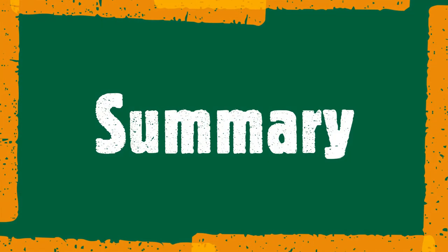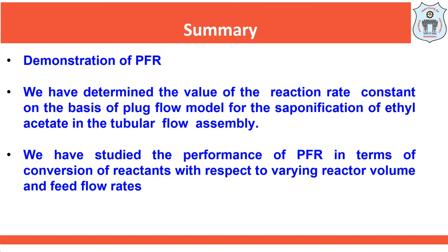We can summarize that in this experiment, we have demonstrated the reaction rate constant of a plug flow reactor, or in short PFR. So we have determined the value of the reaction rate constant on the basis of the plug flow model for the saponification of ethyl acetate in the tubular flow assembly. We have also studied the performance of PFR in terms of conversion of reactant with respect to varying reactor volume and feed flow rates.